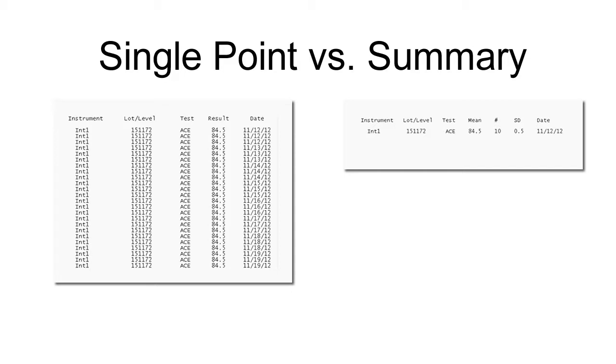Summary data will not be evaluated against any rules, nor displayed on Levy-Jennings charts. It's suggested for Unity Interlab participation only.